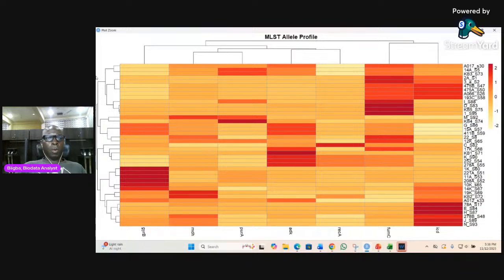For instance, if I now look at it, this is the housekeeping gene one. Another housekeeping gene here. All of them have now been put in blocks. Now, if you pick one block and the colors are the same in the block, like the first two where my cursor is pointing, not the top one, the first two, the colors are the same in one block, same in another one, and another one, and in that order, then we can say that those species have some genetic relatedness.